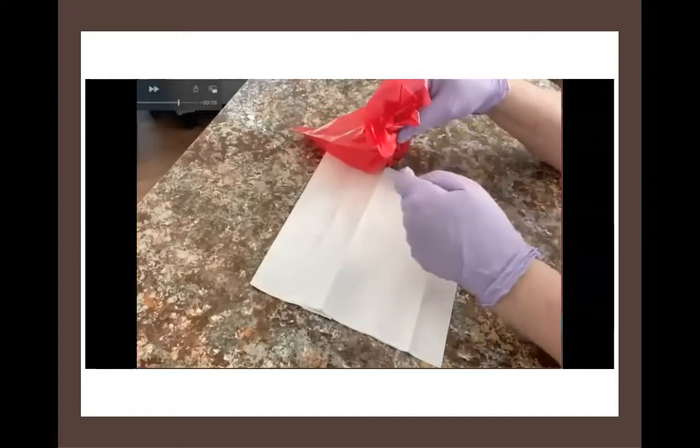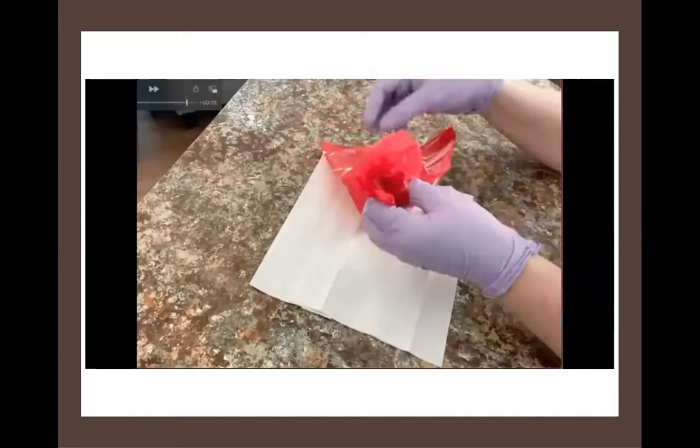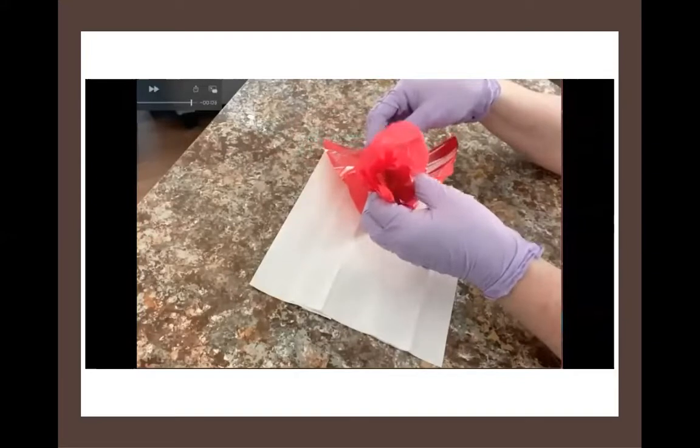We're going to put in the bag. We're going to wrap that bag up with a tie, and that bag is going to go into the autoclave.